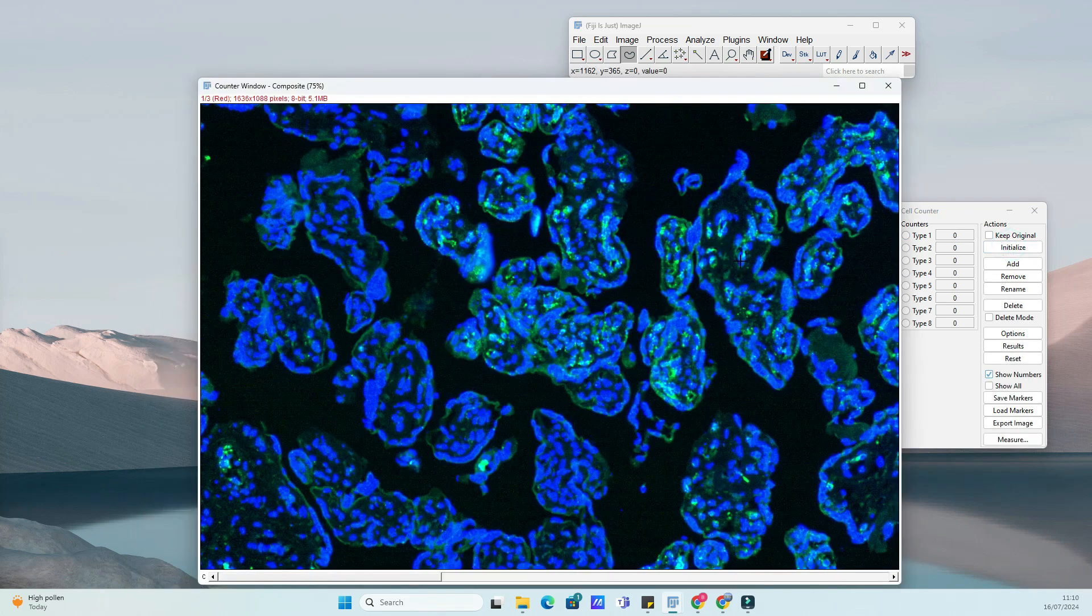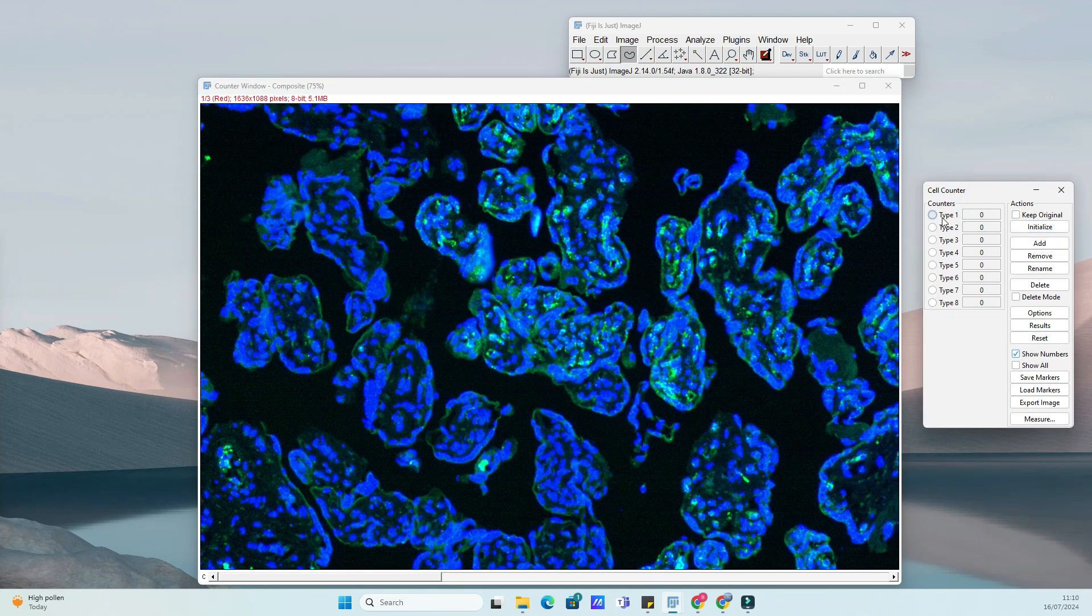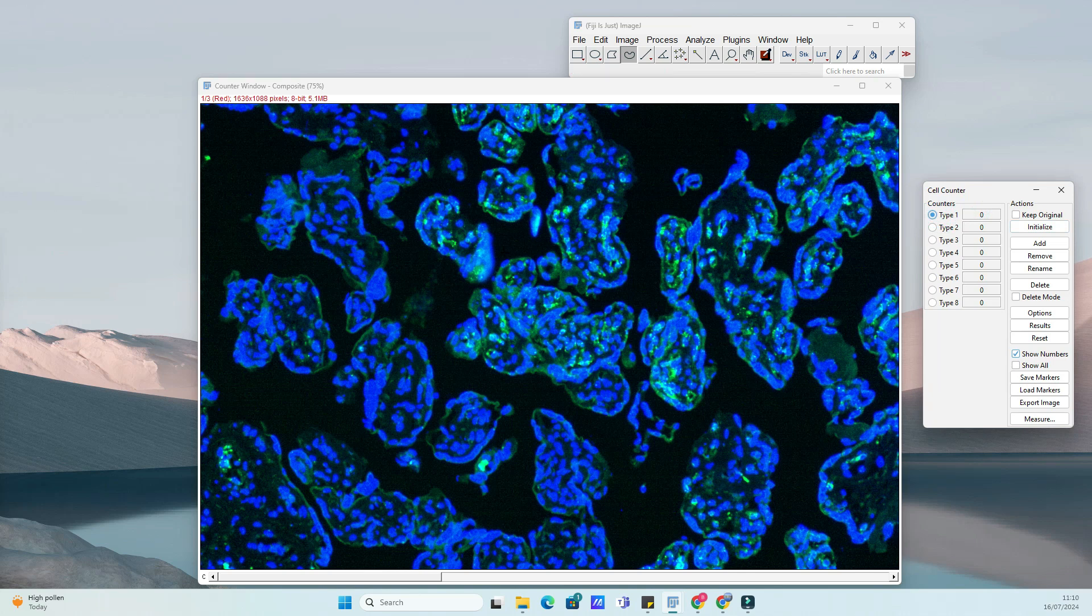Once the plugin is installed, load your image into ImageJ. This could be a fluorescence image, a bright field image, or any other type of microscopy image containing the cells you want to count.